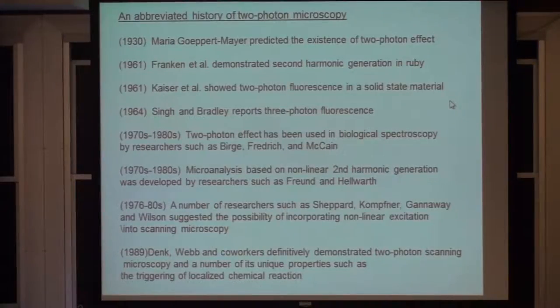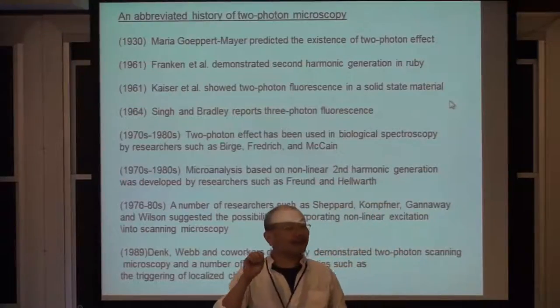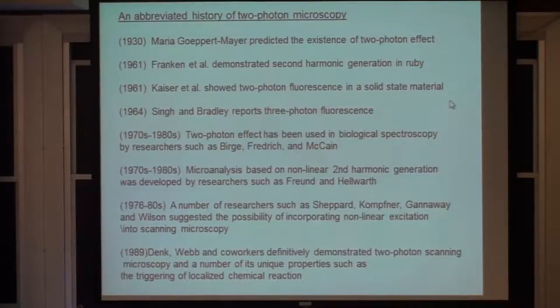Dr. Shepard at that time started thinking about how to do 3D imaging. Dr. Shepard is another important figure in confocal microscopy. He started thinking about what other method he could use to do 3D imaging. One of the things he did was build one of the first second harmonic generation microscopes, which allowed him to image crystal structures in 3D. He tried to use it on biological specimens, but there wasn't a good enough laser at that time. So biological multiphoton imaging didn't happen until almost the 1990s.